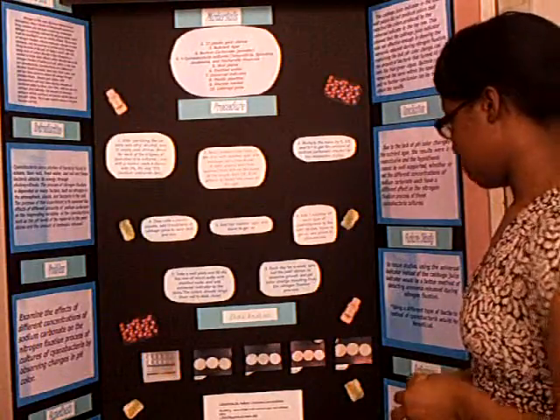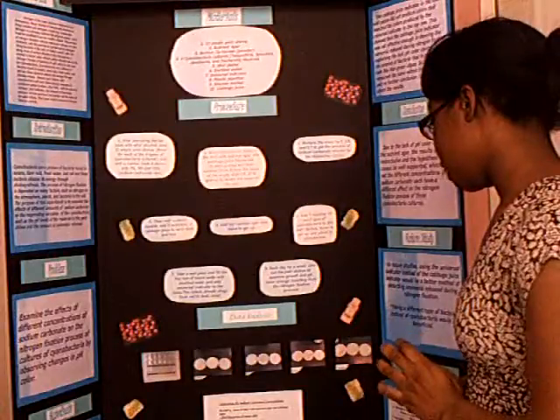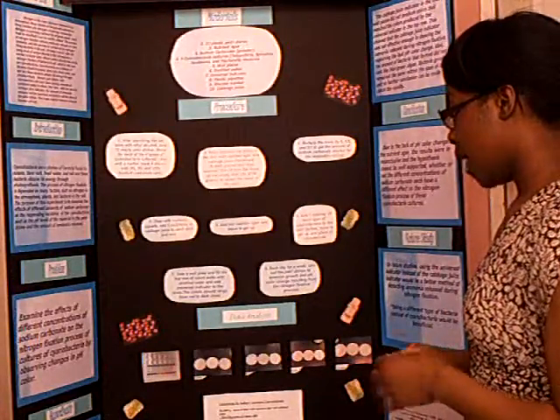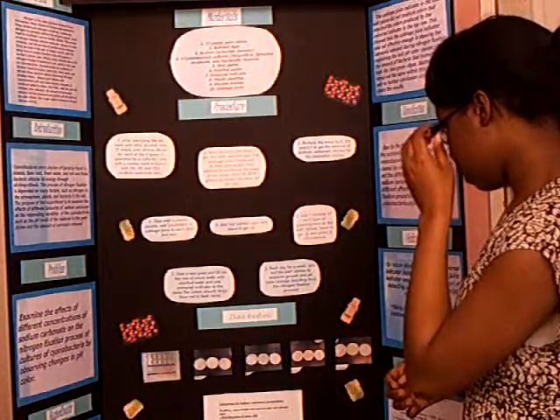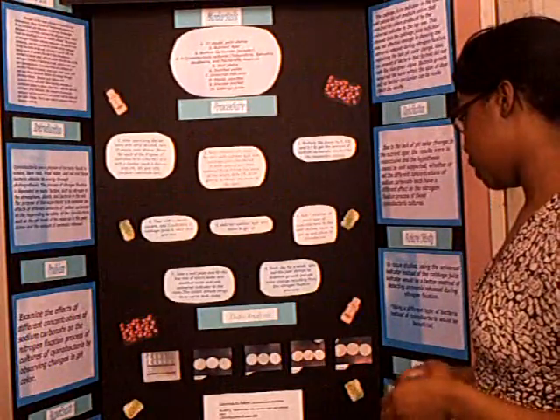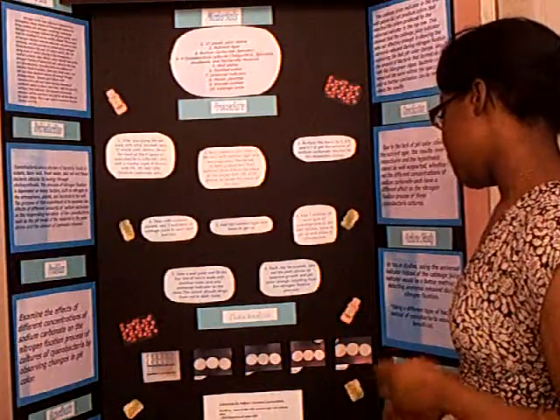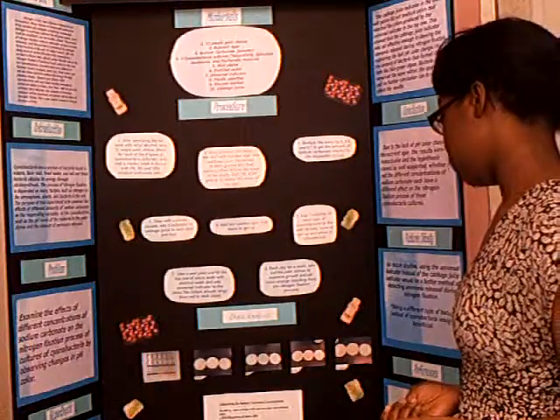the nitrogen fixation process. So for my data analysis, over the 7 days, the petri dishes showed much growth of bacteria, but there was a lack of cyanobacteria, which is the blue-green bacteria. There was no sign of a pH color change to indicate the effects of carbonate on nitrogen fixation. This was the same for each of the types of cultured cyanobacteria when grown under white light.